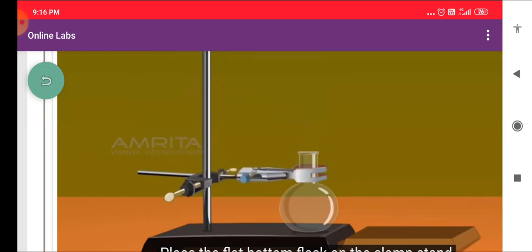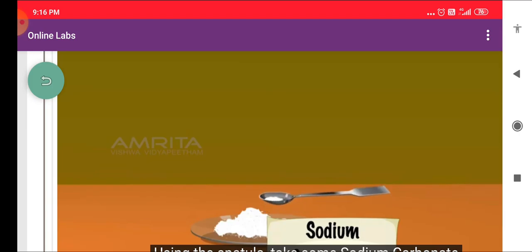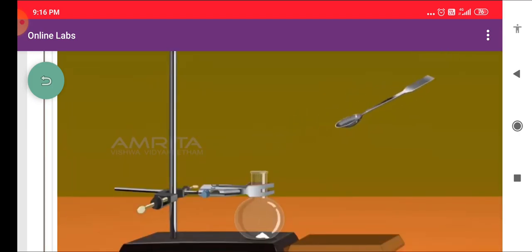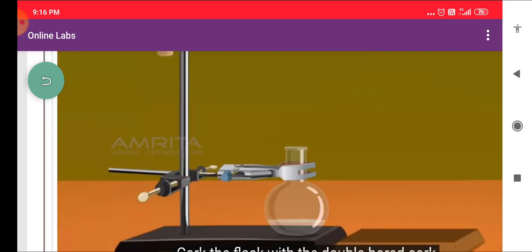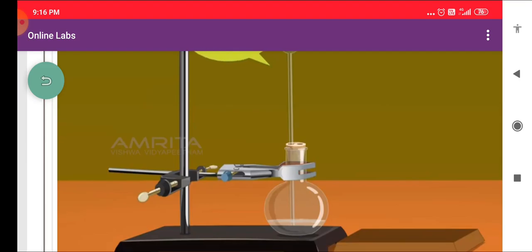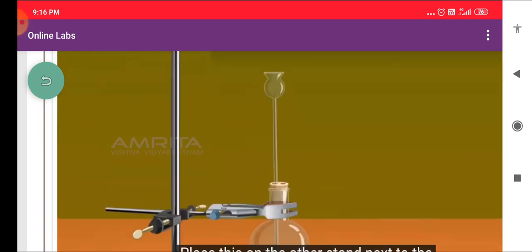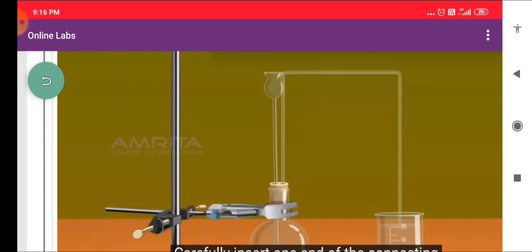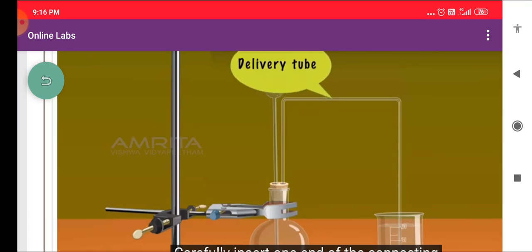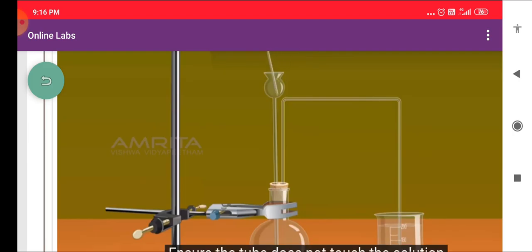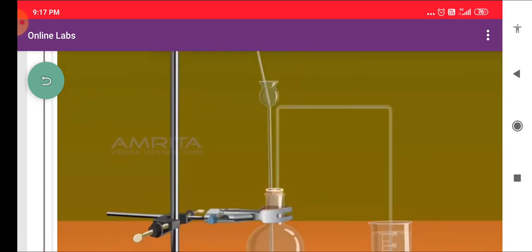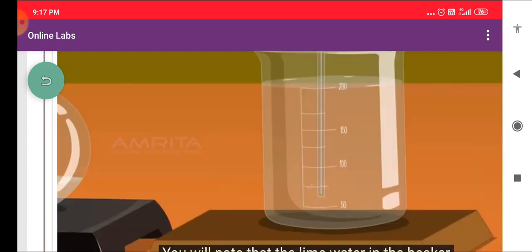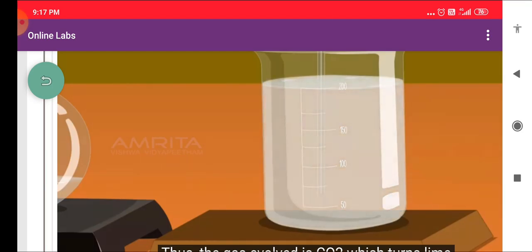Place a flat bottom flask on the clamp stand and clamp the neck of the flask. Using the spatula, take some sodium carbonate from the dish and put it into the flat bottom flask. Pour some distilled water into the flask and cork it with a double board cork. Insert the thistle funnel through one hole in the cork. Place a beaker of lime water on the adjacent stand and insert one end of the connecting tube into the flask through the other hole, ensuring the tube does not touch the solution. Place the other end of the tube in the lime water. Pour some HCL solution through the thistle funnel into the flask. A gas is evolved, and the lime water in the beaker turns milky — thus the gas evolved is CO₂, which turns lime water milky.